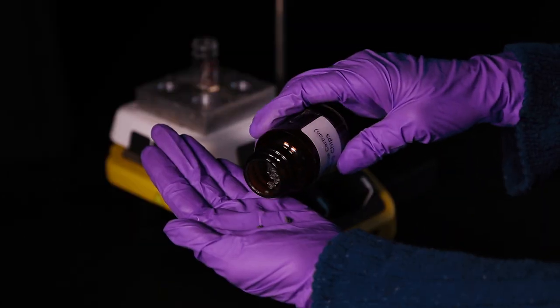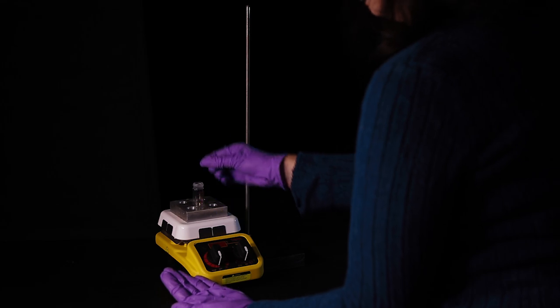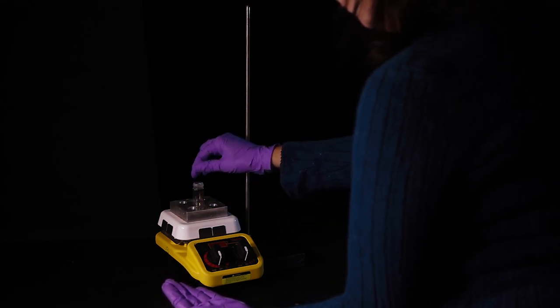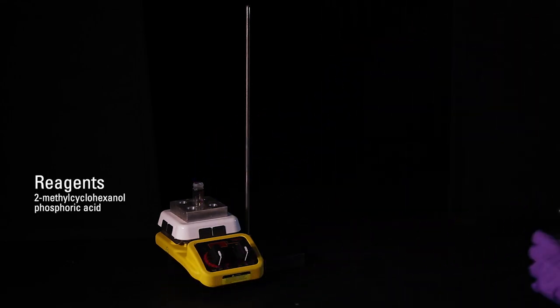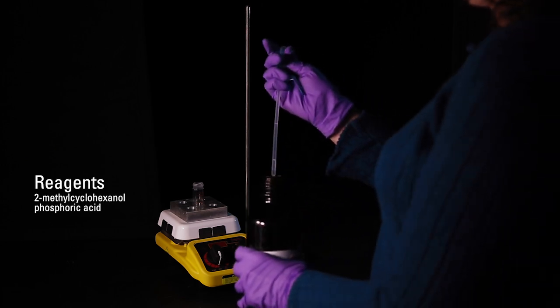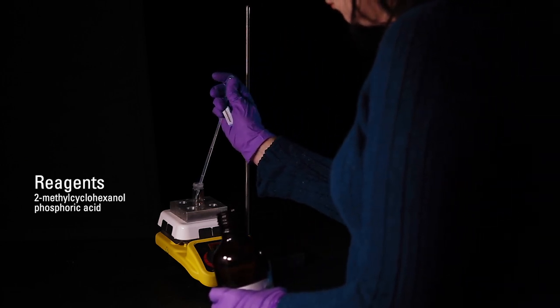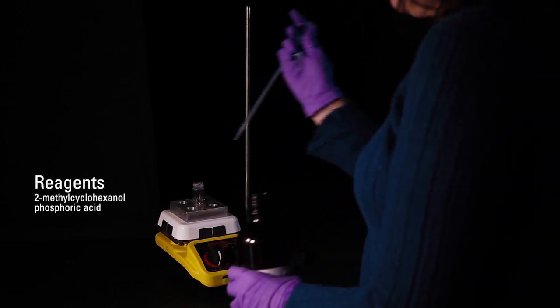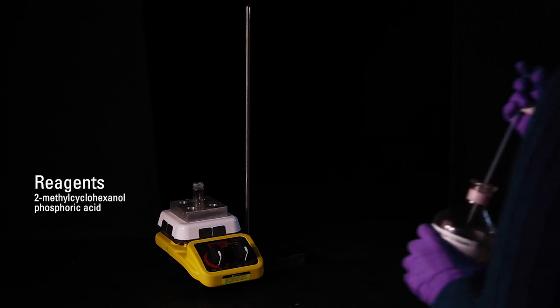At this point, add 2 or 3 boiling chips to the conical vial, then add the reagents to the vial. In this particular case, the reagents are 2-methylcyclohexanol and phosphoric acid.